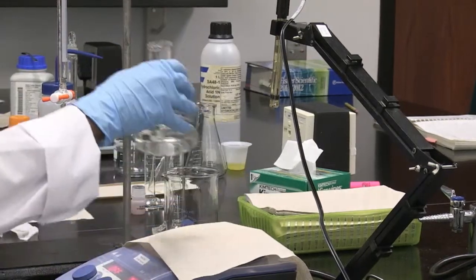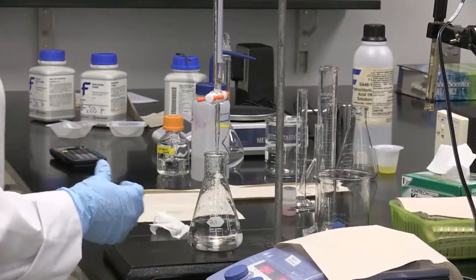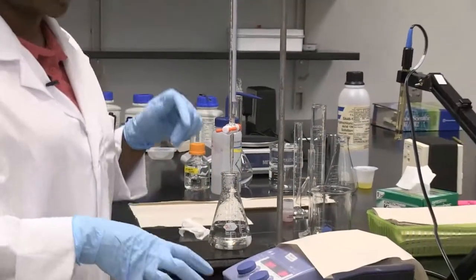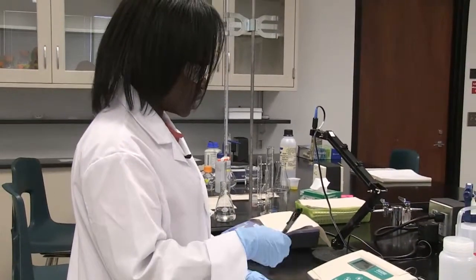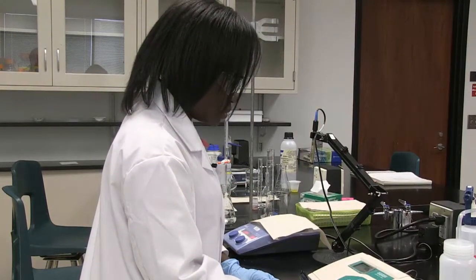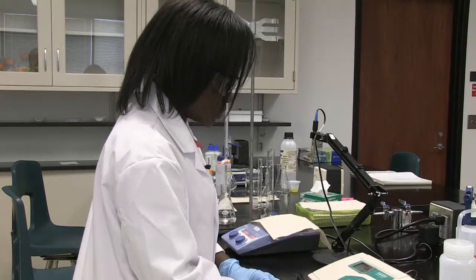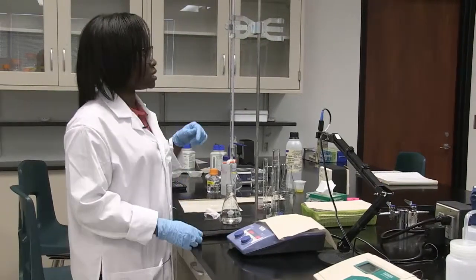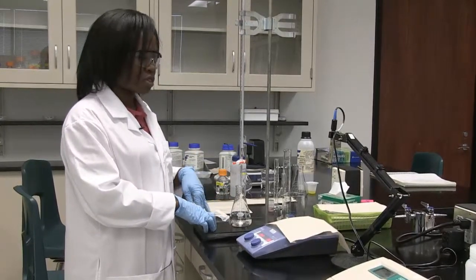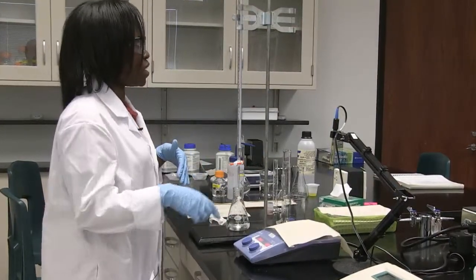Now I'm going to titrate with my base. I record the initial reading on my burette, which is 15 mL. That will tell me how much sodium hydroxide I'm adding each time. I'll start by adding 0.5 mL at a time, mixing on the stirrer, and then recording the pH each time.